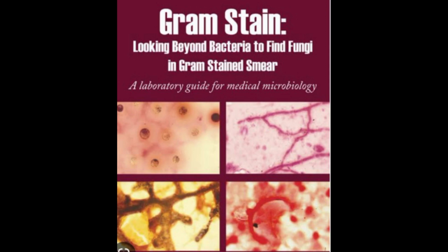Nugent scoring of vaginal swab for diagnosis of bacterial vaginosis. Lactobacillus species.